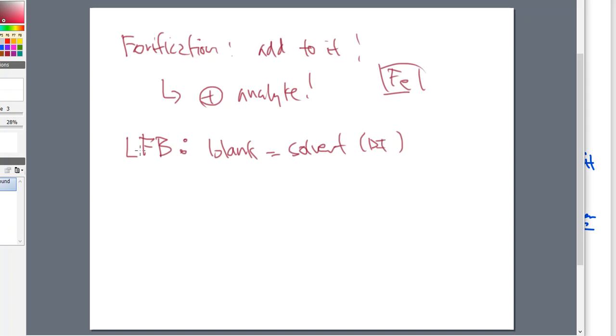So with the laboratory fortified blank, fortified means you add. And what do you add? You add what you're trying to measure. So in this solvent, I'm going to add the analyte that we are looking for. That way, this is a known concentration. I know what I've added. I know that it's there. And again, this should be different than the calibration concentrations that you have used to make your standards with. They should be totally different.